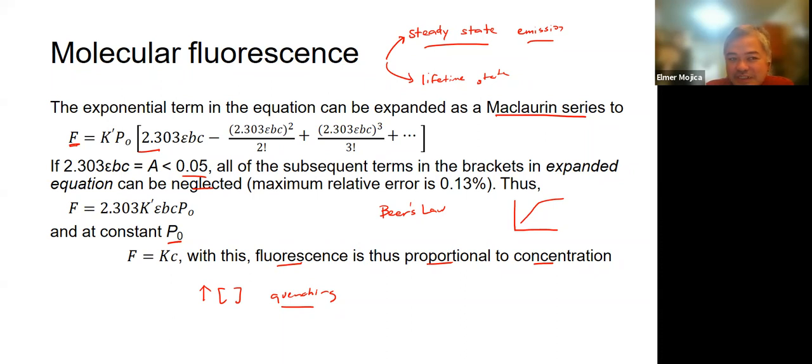And sometimes there are some systems that are dependent on the pressure and the temperature. Okay? So yan yung one, we could say, problem that we usually encounter in fluorescence. Yung tinatawag nating quenching. Okay? So may limit din, kagaya doon sa Beer's Law.